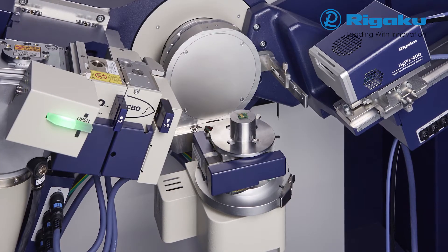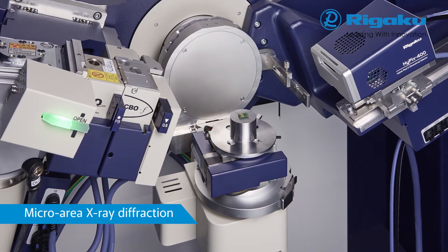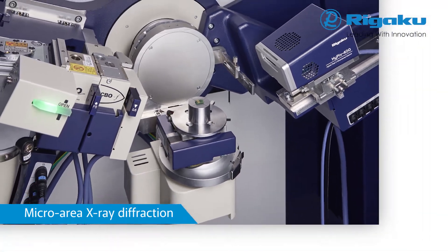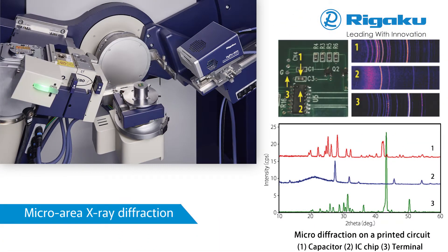Micro-area X-ray diffraction employs a focused beam as small as half a millimetre in diameter at the measured area. This position is specified by clicking on a camera image displayed in the software.